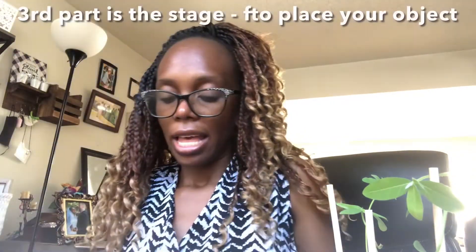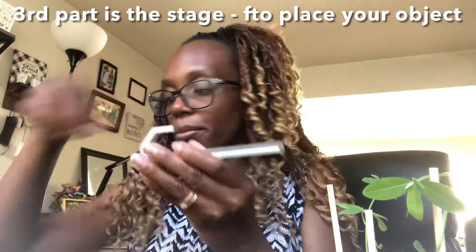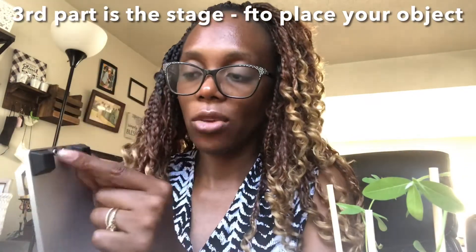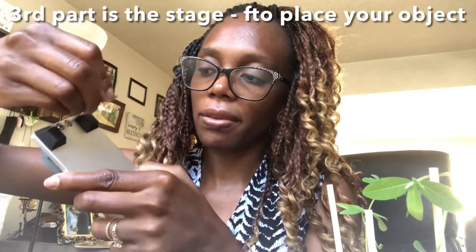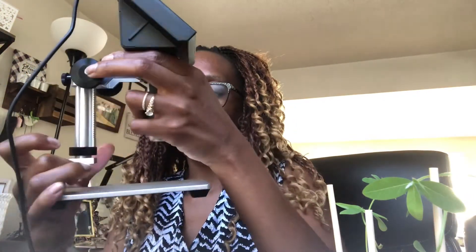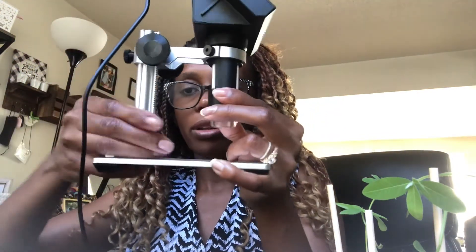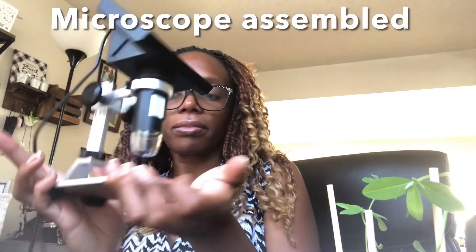It's firm, and you may have to unscrew it the first time you put it in. I've put the first two parts together, and now with the bottom section attached, we have our microscope fully assembled.